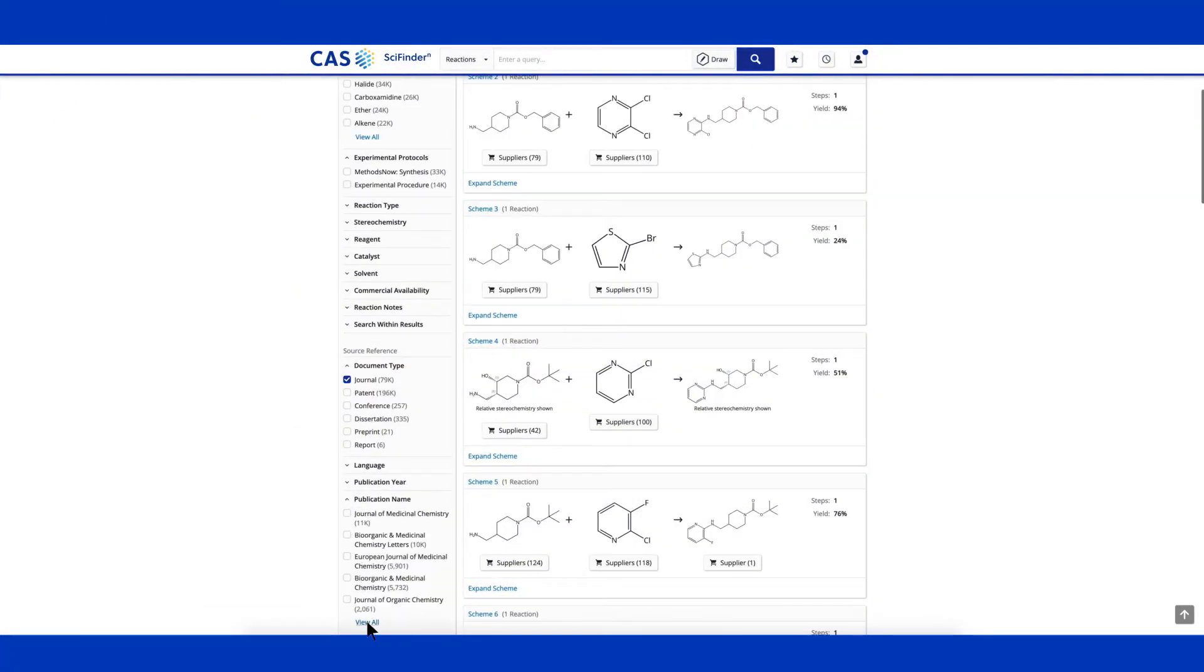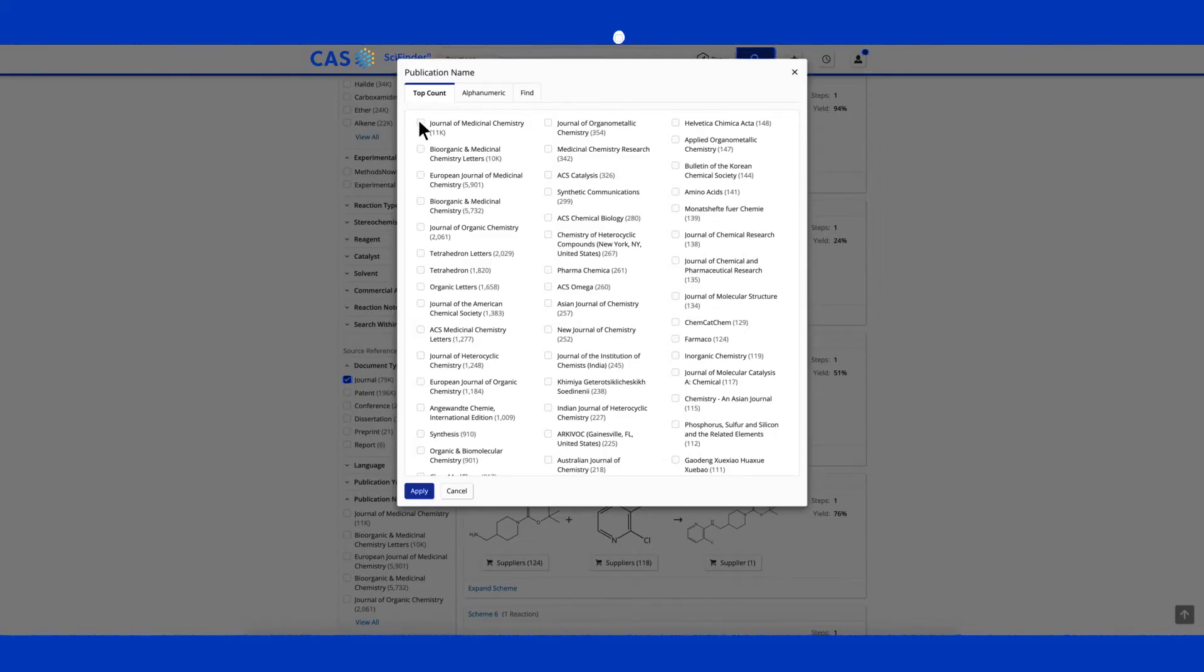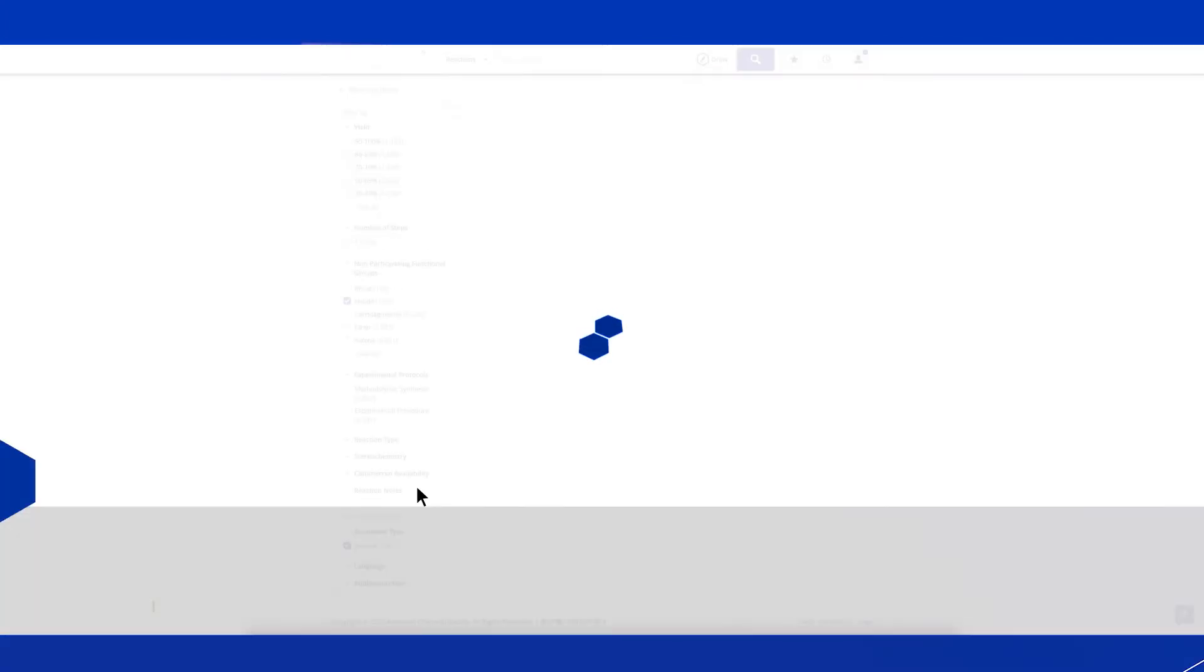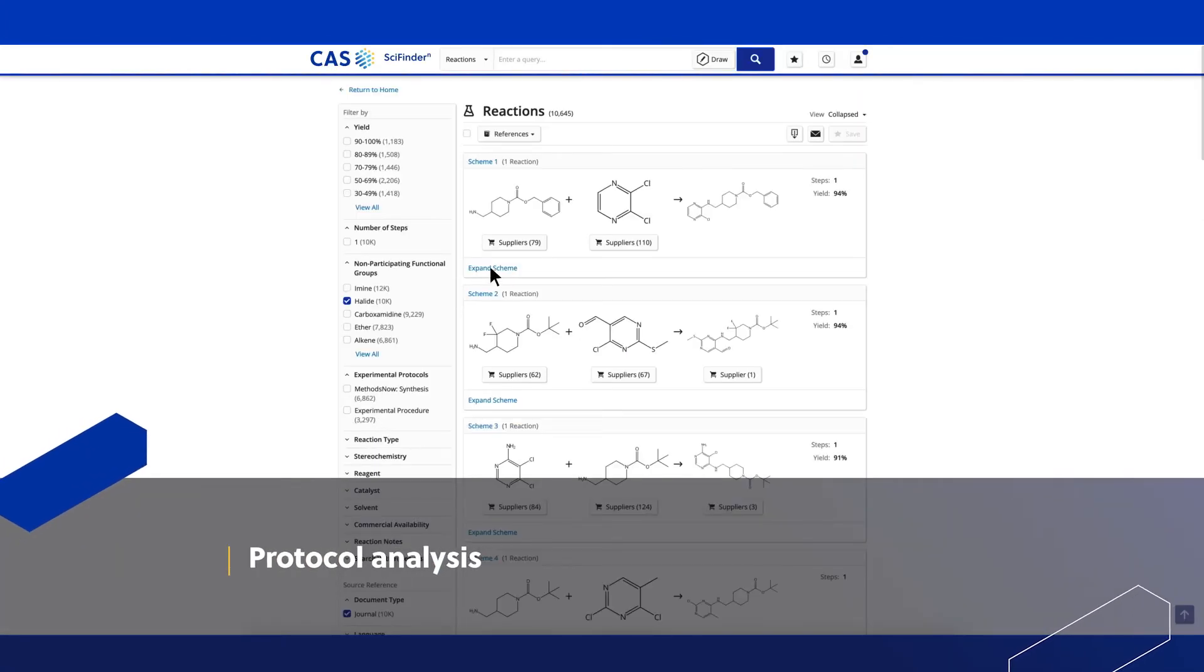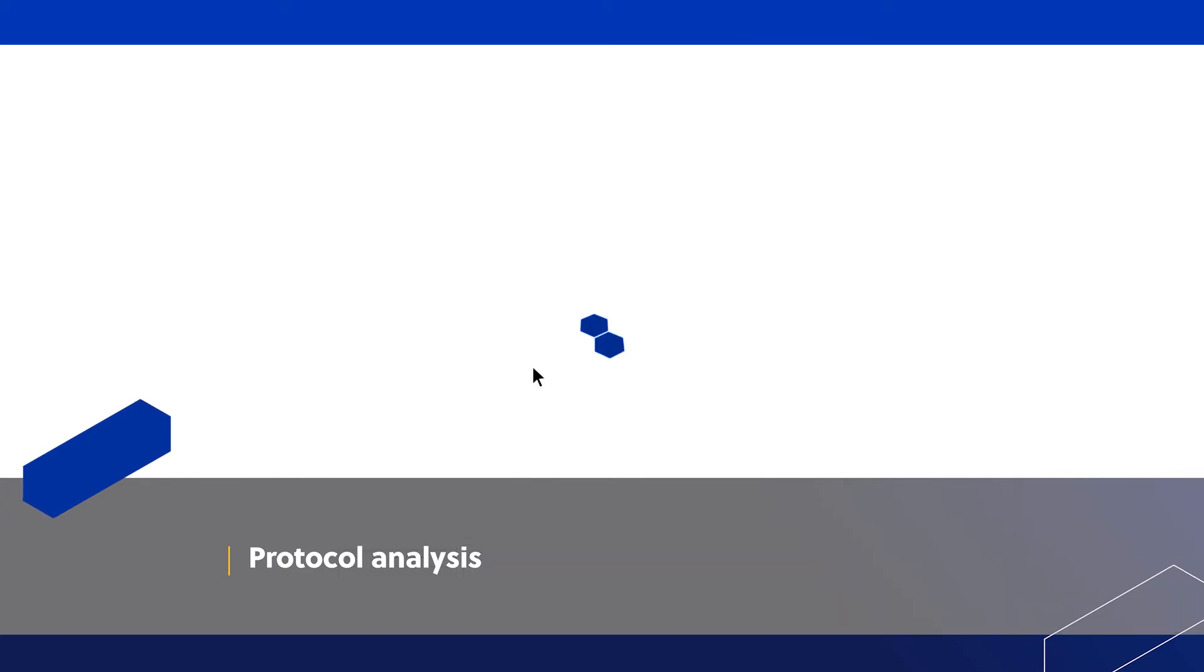SciFinder N makes evidence reviews simple with filters like publication names and explore related protocols associated with the reaction evidence.